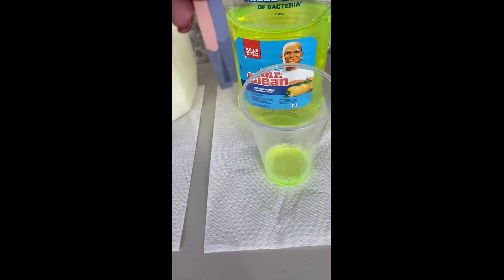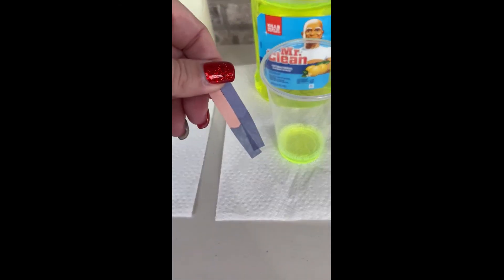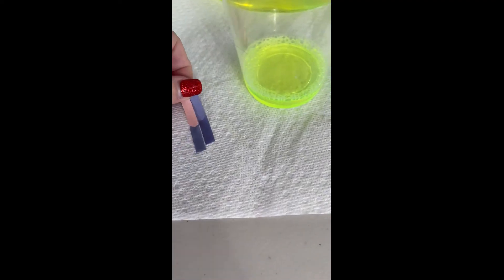Here's our floor cleaner. You can see that the red litmus paper did turn blue, and it looks pretty dark, so I'm going to say that's a strong base.